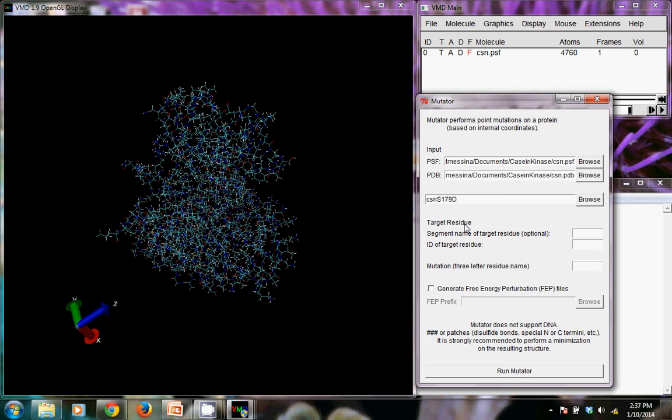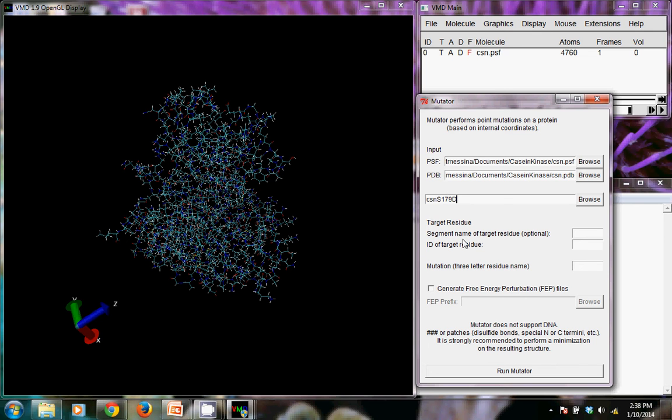In a future video, I'll show you how to mutate serine to phosphoserine. What we're doing with this project is looking at how phosphorylated amino acids affect the structure of the enzyme here. And so the aspartic acid mutation gives a negative charge to what was a serine so that we can look at the charge effect that would be there because of the phosphate.